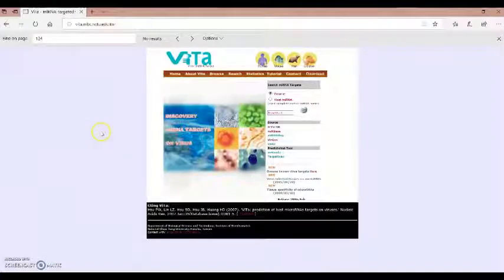But let us get working now with ViTa through the website itself. Once you have navigated yourself to the ViTa homepage, you will enter the virus of interest. In this case, it is an Ebola virus. Go and press go.